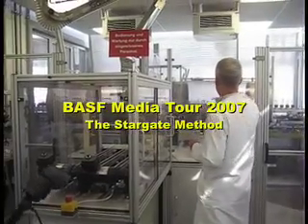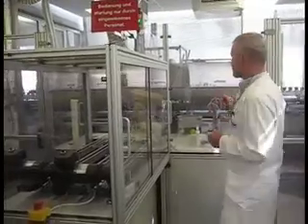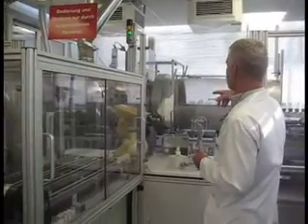The plants are moved along the conveyor belt and into this — we call it Stargate. Simply because you see it in a moment once it starts.